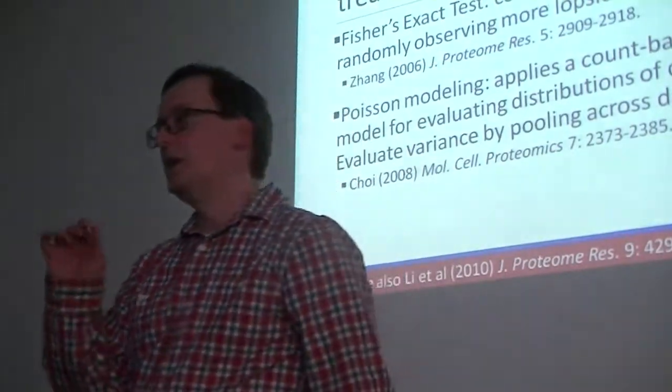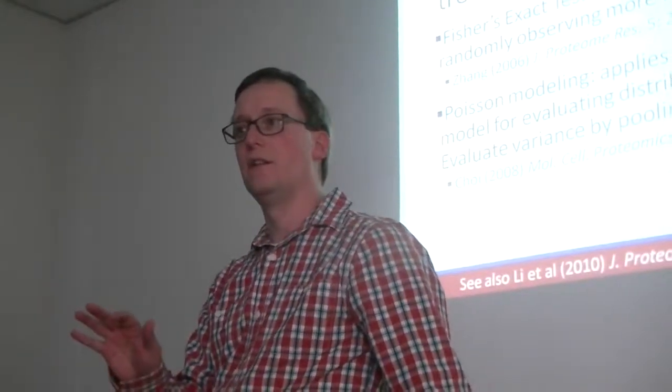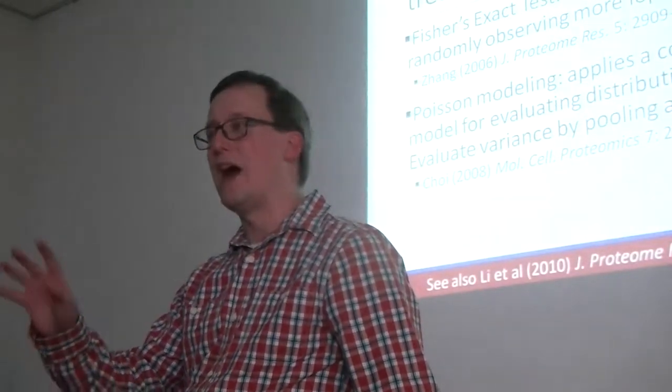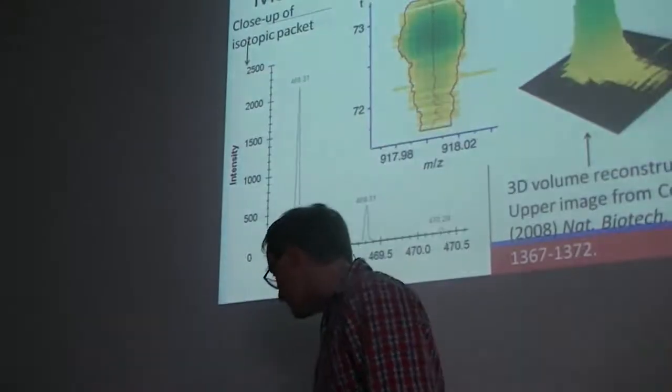So if you have only spectral count data, you should probably say, I can tell which proteins are differing, but I can't have a very accurate estimate of how much they're changing. There are other methods that have been created for that purpose, though.